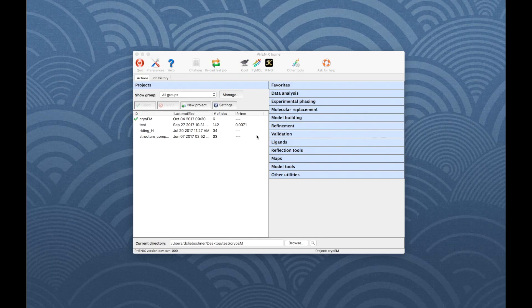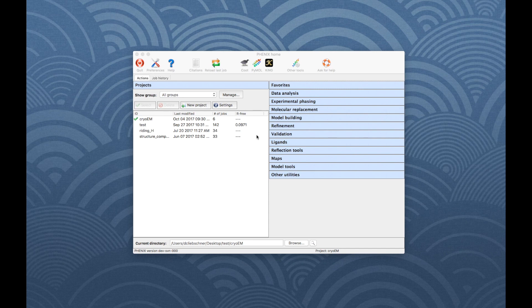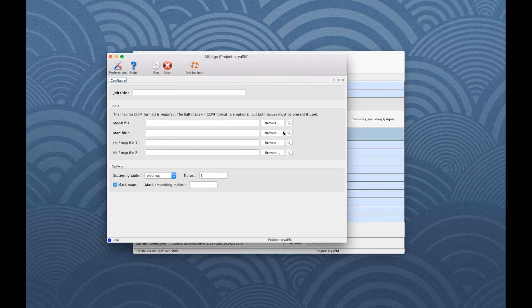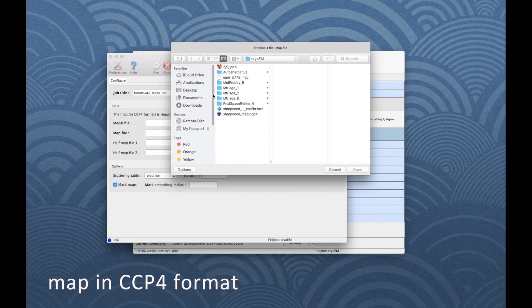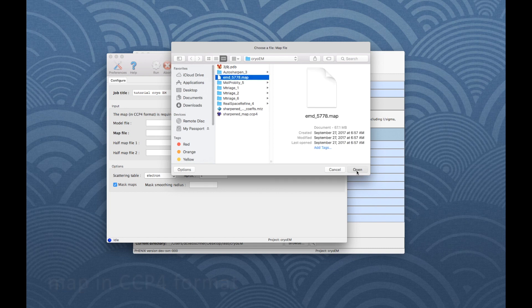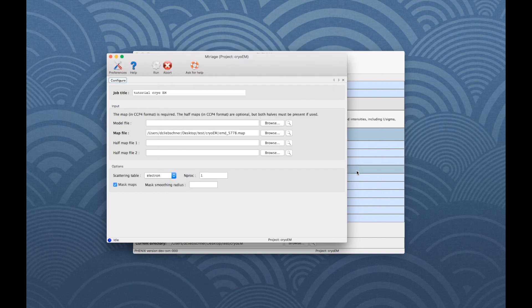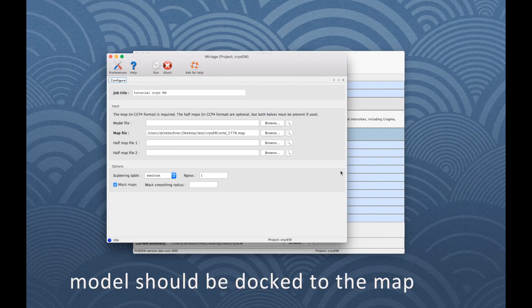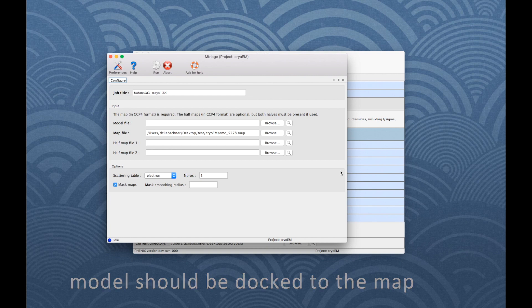Now let's have a look at the individual programs. To start mTriage, go to Data Analysis and click on the Program button, which opens a new window. Minimal input for mTriage is a map in CCP4 format. Additionally, the program can use a model and two half-maps. Please note that here and for all other programs, the input model should be already docked to the map.